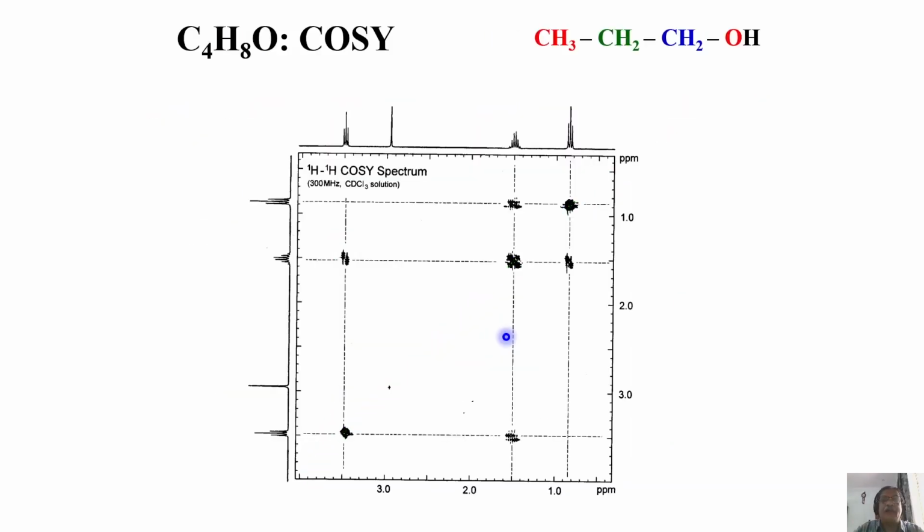And let us try to now start with a simple, realistic example of a COSY spectrum like this. The 1D spectrum of this molecule is given as a projection here. Now, this is a CH3 proton. I know it always comes at high field. Of course, it's a simple spectrum I can interpret. Assuming I don't know anything about the analysis, I simply ran a COSY. Now start with one peak. At least we have to start with something. We'll start with this peak.